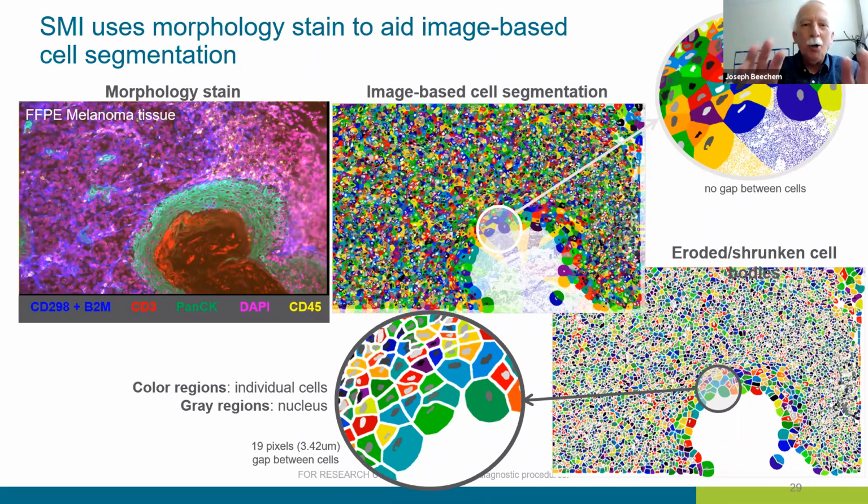So you can see now I'm going in there and generating them, blowing up the segmentation. Look at that in the lower middle. You can actually see cell outlines. You can see all their different shapes. We actually got the DAPI nucleus inside each one of those too, because these cells all don't line up like this. They're actually curving around, and it's all dependent on how the microtome chopped through this particular tissue.